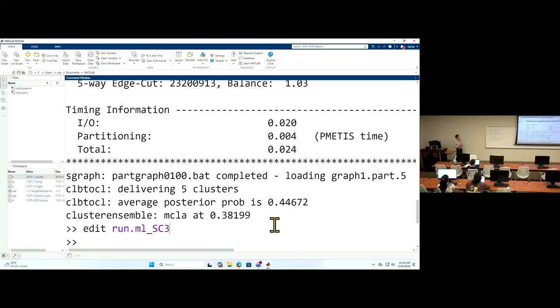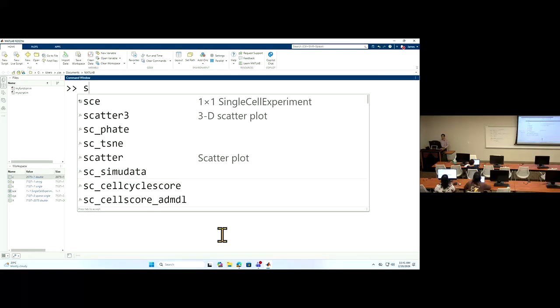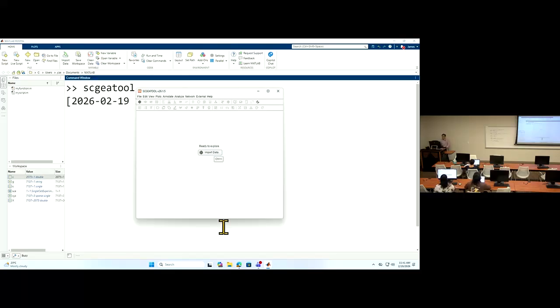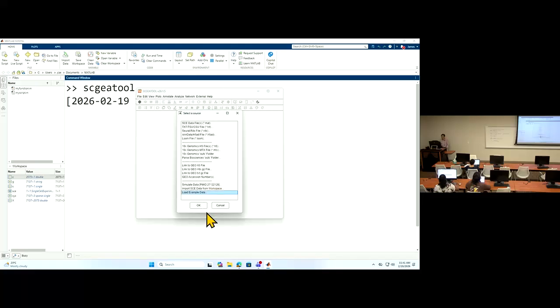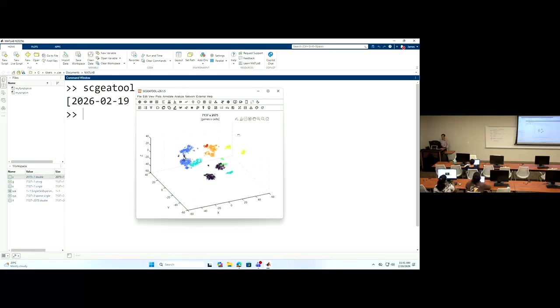We still have 20 minutes to prepare calling R. So let me show you the interface. If we have data here, there are external functions.